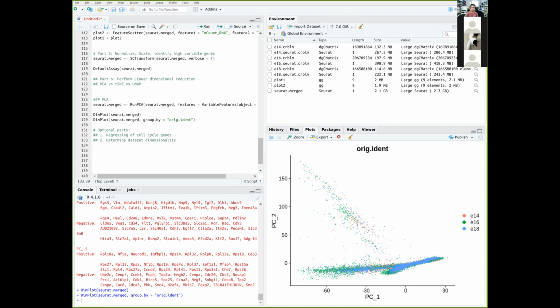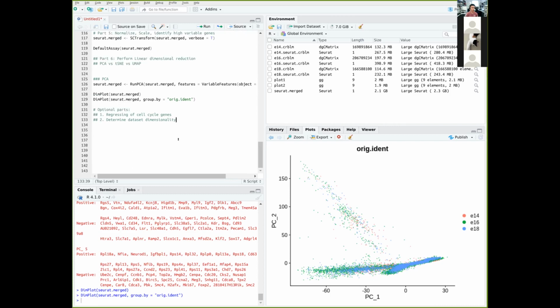But if you use more dimensionalities, it means that you are taking into consideration more variable genes, and therefore your clustering, for the dimensional reduction, will be a bit more accurate. So if you understand your dimensionality and use the right value, you can actually get better separation, better segregation. Maybe we can try it a little bit later on when we run some of our code and see how it differs. Okay, so just these two parts, try it on your own. Okay.